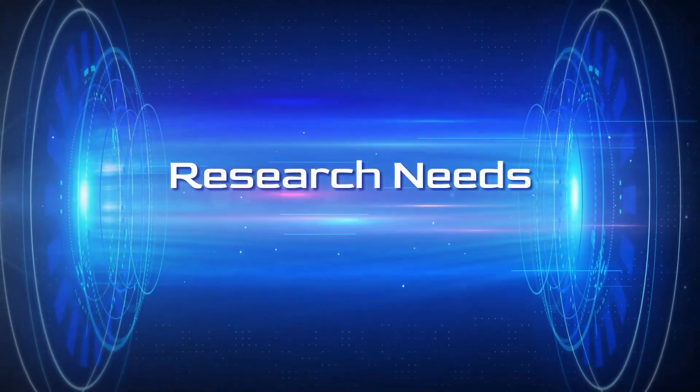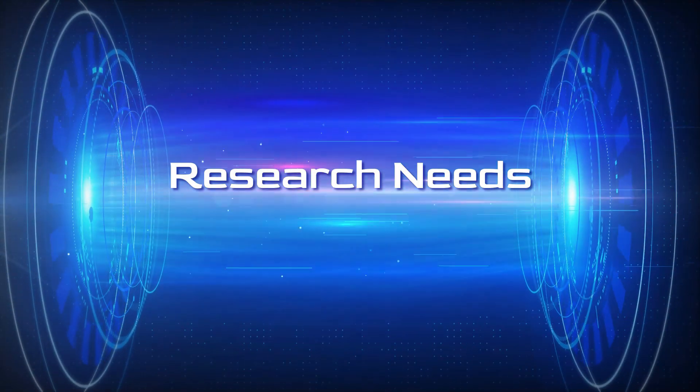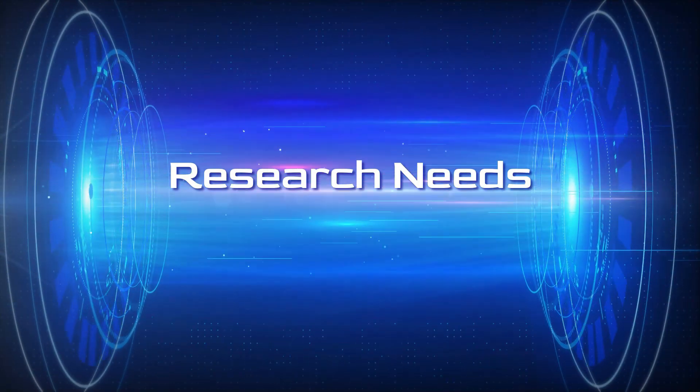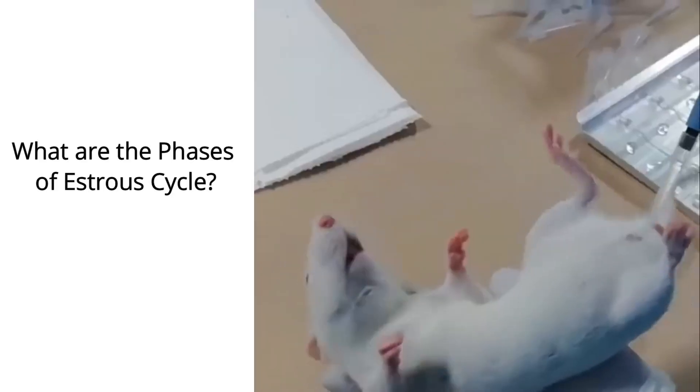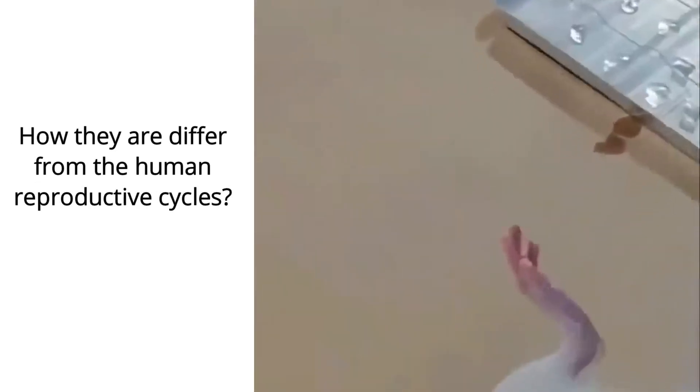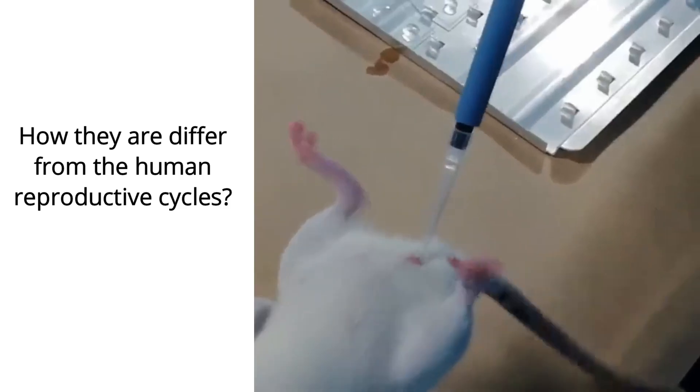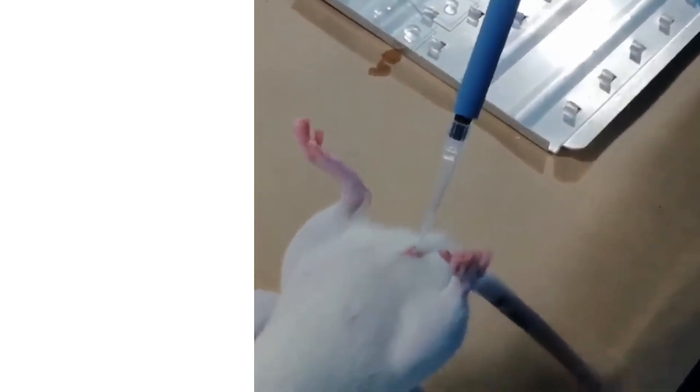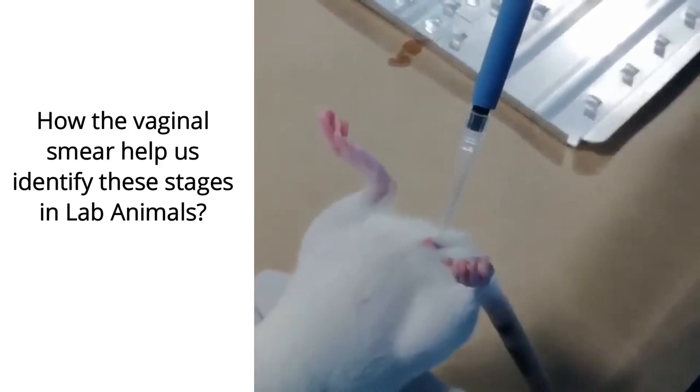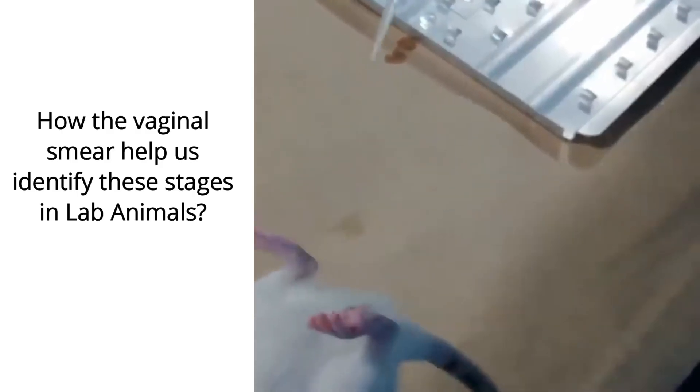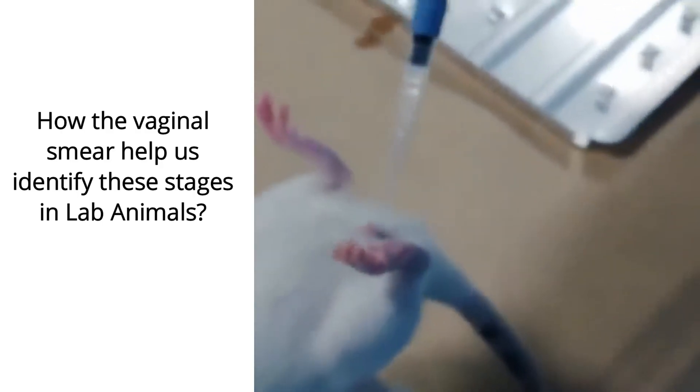Hello friends, welcome to Research Needs. In this video we will see the phases of estrus cycle, how they differ from the human reproductive cycles, and how vaginal smear helps us identify these stages in lab animals.